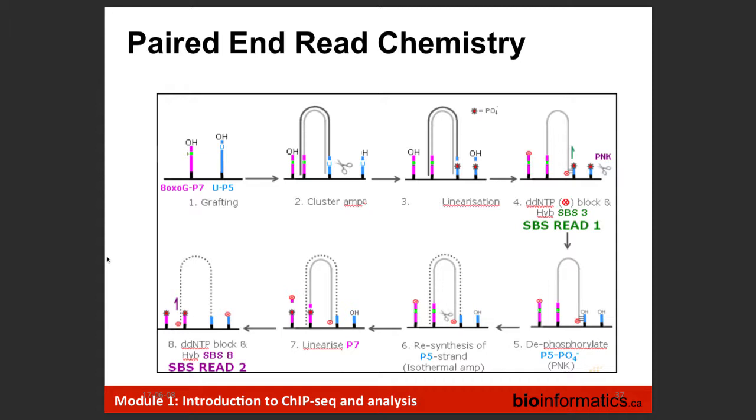In the Castaneus example, I imagine there must be probably more than 2% mappability. I'm giving you the example for a human genome, so you're going to see a little bit better mappability. Martin, in this example you can also relax the number of mismatches. You can allow more mismatches and then rescue alignability with the paired end. Because the more mismatches you allow, the more you can map the read in multiple locations, but with the paired end you can still rescue this.